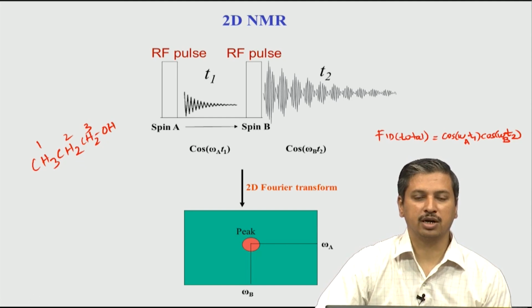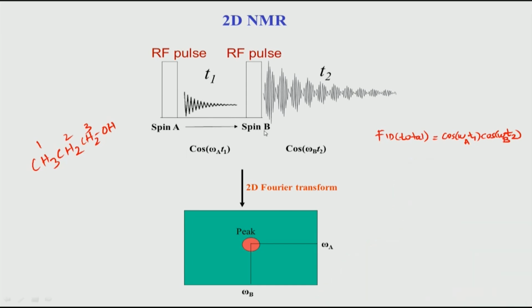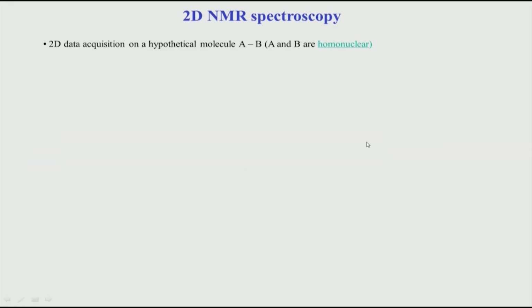So, this is how we understand how the efficiency matters, and this is a very important concept because one of the main areas of research in NMR is to maximize this transfer efficiency, because the sensitivity depends very much on how much you get transferred to B. So, for example, if I keep 99% on A and I can transfer only 1% to B, my system is very weak in intensity. My B spin energy when I finally get this FID will not be very good in signal to noise. So, optimizing, increasing, maximizing this transfer is a nice important area of research.